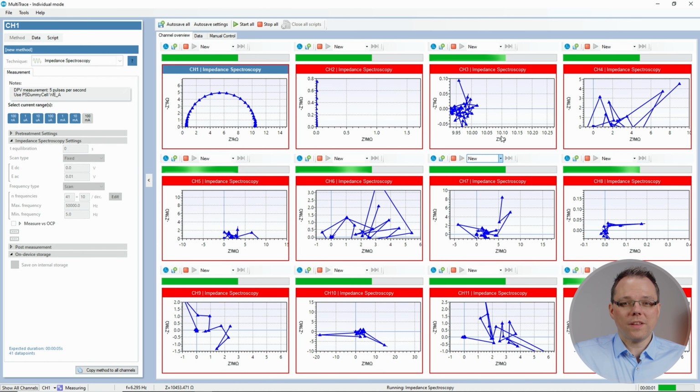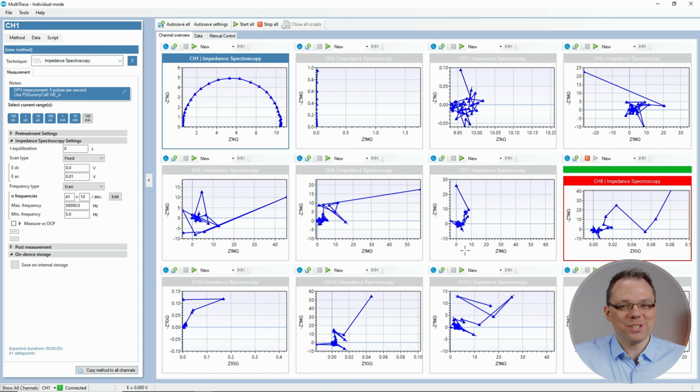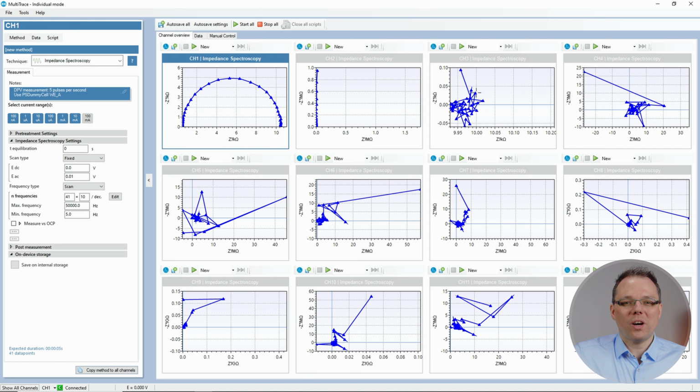As I mentioned, for 4 to 12, that's all just rubbish because nothing is connected. For channel 3, it's just a single resistor, so all the points are scattered around one point. This is our redox circuit, our WEA on our dummy cell, and this is the Randles circuit as an impedance spectroscopy. But you see now I performed impedance spectroscopy with all of them.